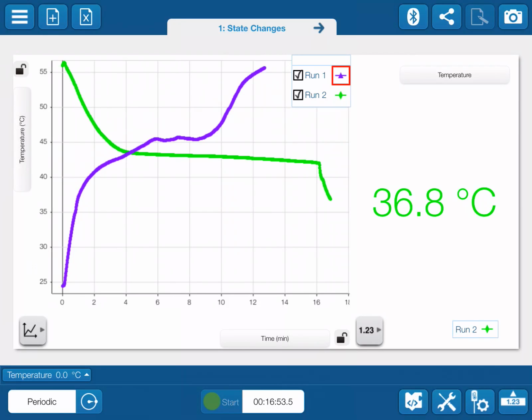When the lauric acid was cooled, then you see at 0 minutes on this green line, this is 0 minutes starting at the high point, and then you get a very steep downward slope for the first about 2.5 to 3 minutes, where you only get it going pretty much straight downward.